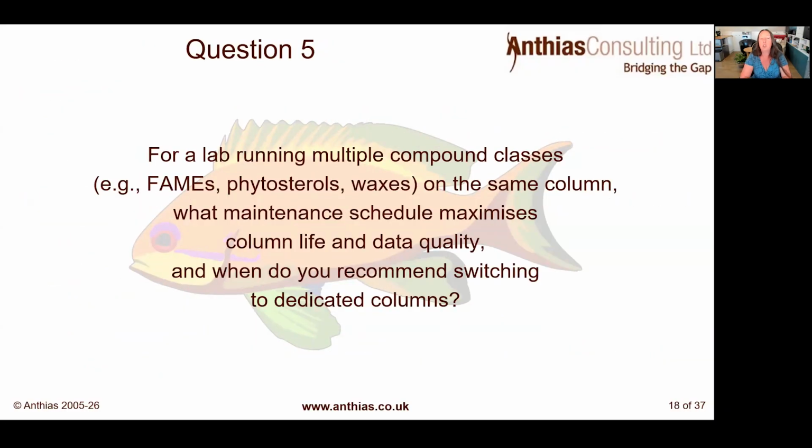So moving on to question number 5. For a lab running multiple compound classes, for example, FAMEs, phytosterols, and waxes on the same column, what maintenance schedule maximizes the column length and lifetime and the data quality? And when do you recommend switching to dedicated columns?